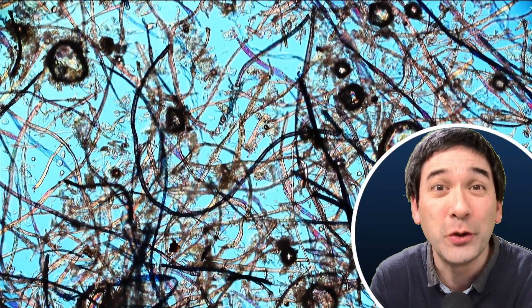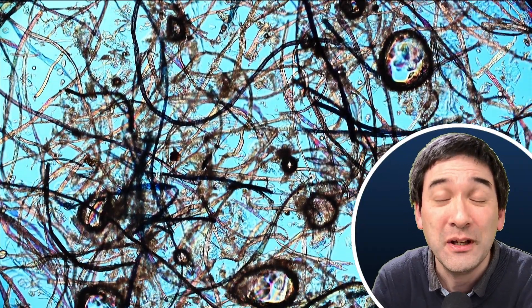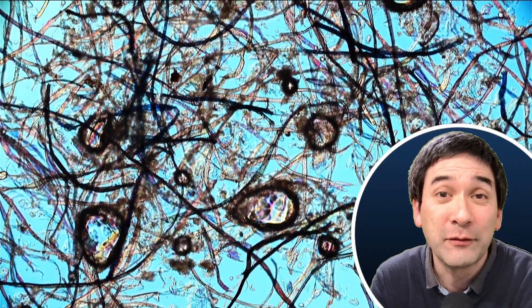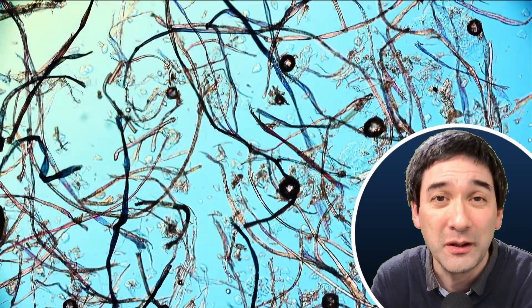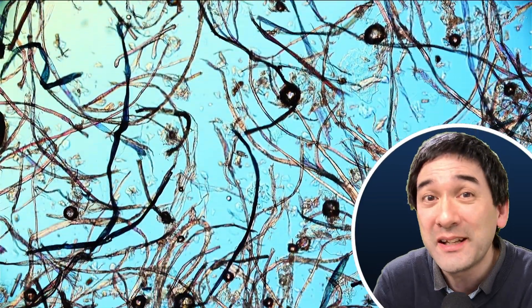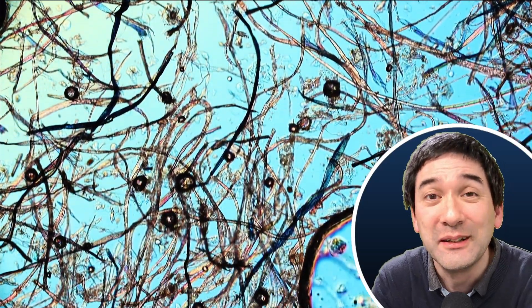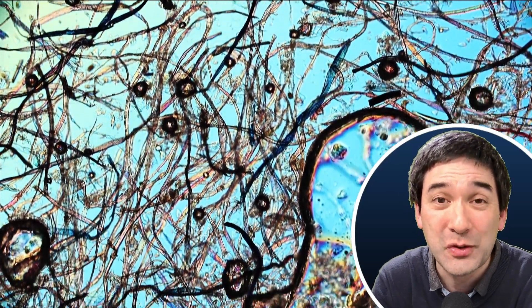I tapped it on my microscope slide and this is what I saw. A lot of fibers, and those fibers are mostly from textile, from clothing that I'm wearing. But maybe there are also a few hairs in there as well. Those round bubbles that you see, these are air bubbles because I added a little bit of water when preparing the microscope slide.